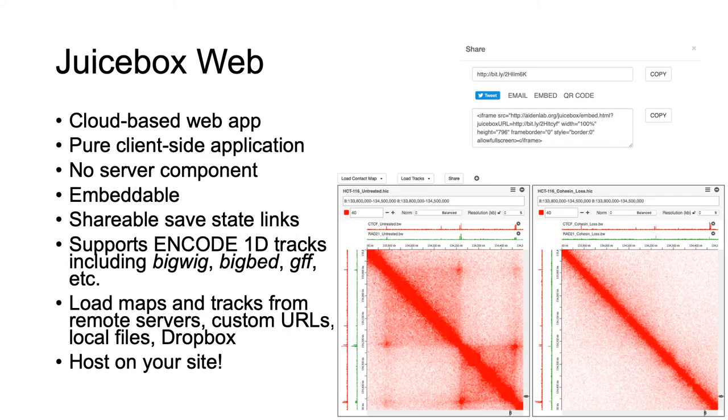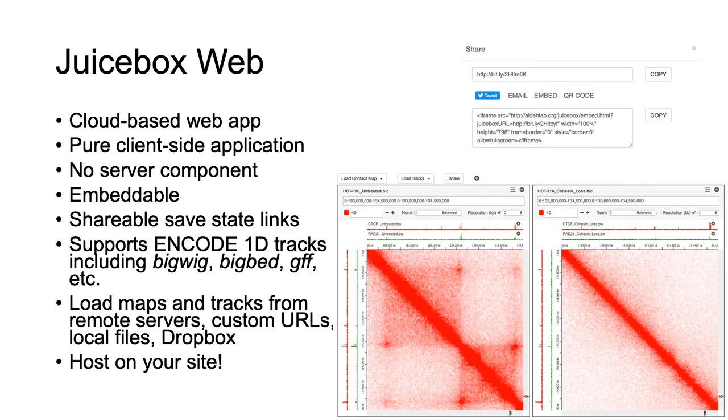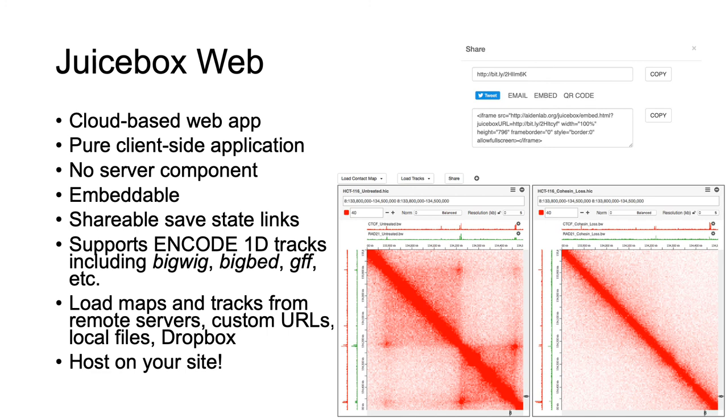JuiceBox Web is a cloud-based web app that has no server component. It is embeddable and allows you to easily share what you're looking at with friends and colleagues. As with JuiceBox Desktop, it supports encode 1D tracks including BigWig, BigBed, GFF, etc. And you can load maps and tracks from remote servers, custom URLs, local files, Dropbox, Google Drive, or wherever you'd like. You can even host your own JuiceBox on your own site.